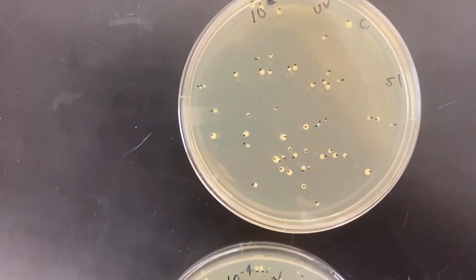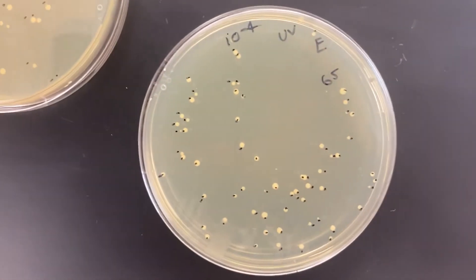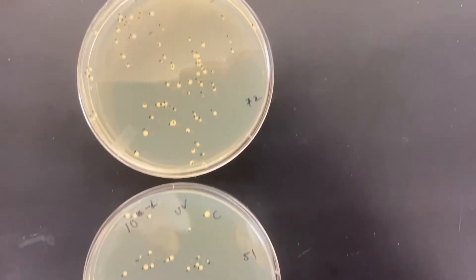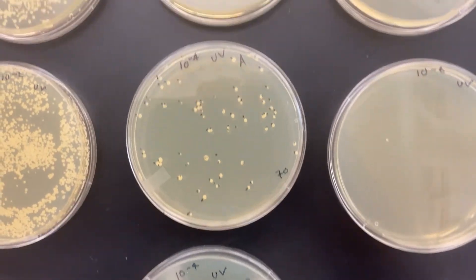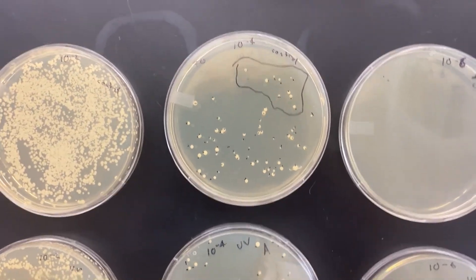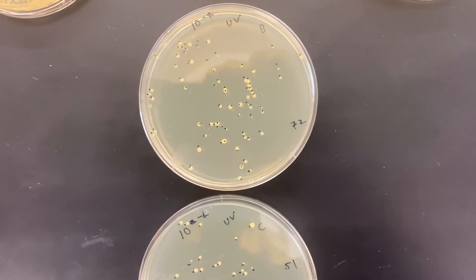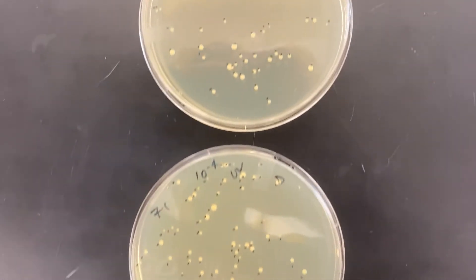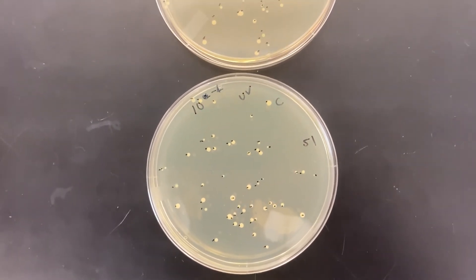72 — and nobody's perfect — here we're down to 51, 71, 65. So three out of these plates are within one or two of the control. This is really building my confidence that I did the dilution and pipetting correctly. If you do this and you don't get numbers this close, that's okay — it gives you a goal to shoot for. Reproducibility is important in biology.